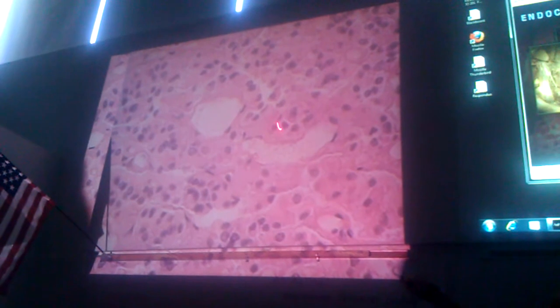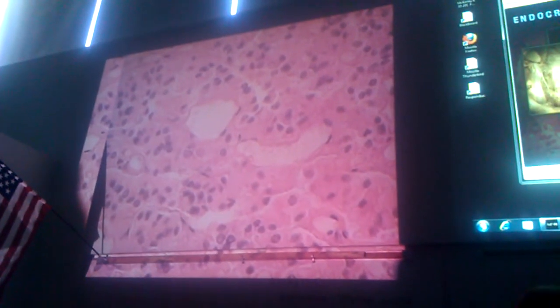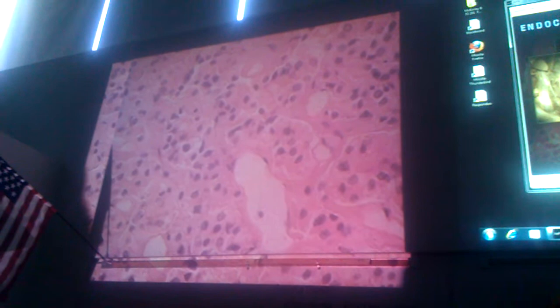And then, kind of a circular nucleus there, and another one here, and another here. And they're all just kind of scattered around amongst all these blood vessels. And they're producing the hormones. They're going to go out to glands and stimulate the glands.